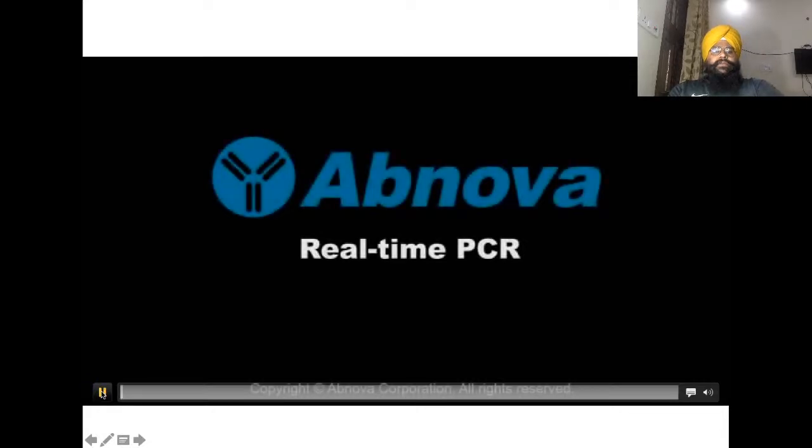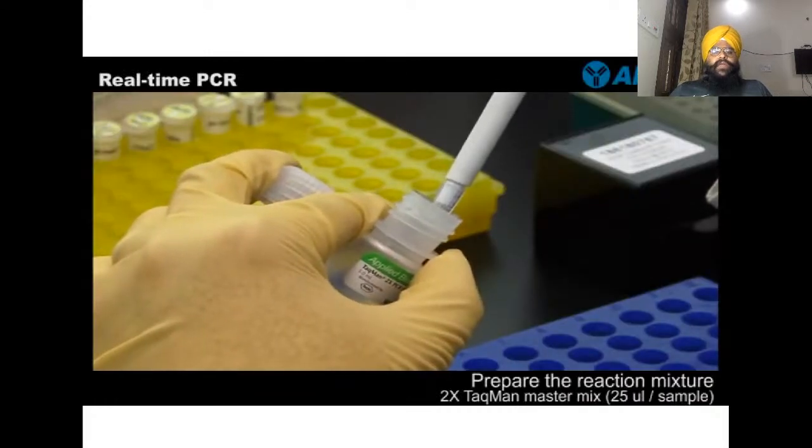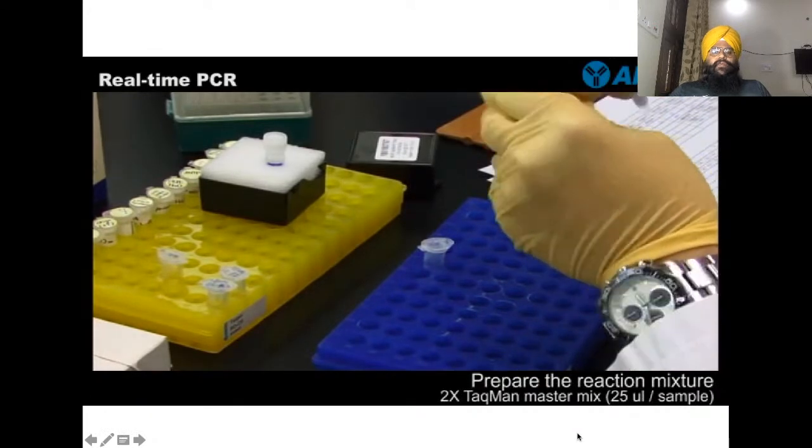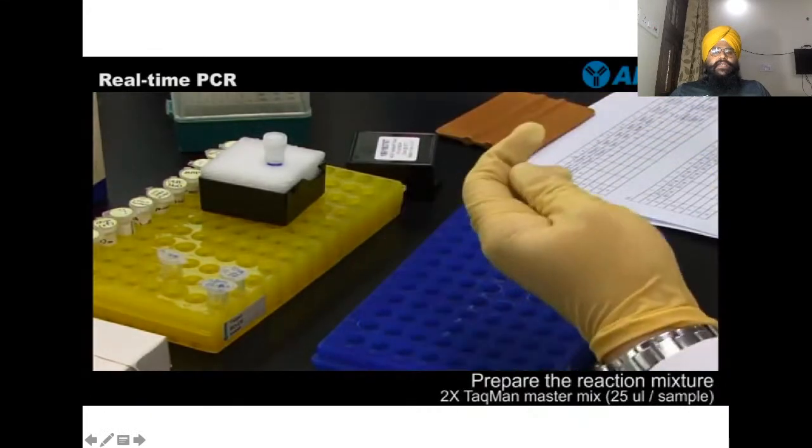So let's check. This will be without audio. They will be showing it with this. Prepare your reaction mixture for like 2x TaqMan master mix.